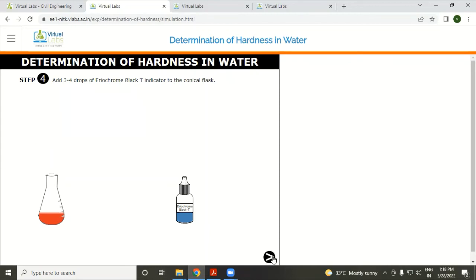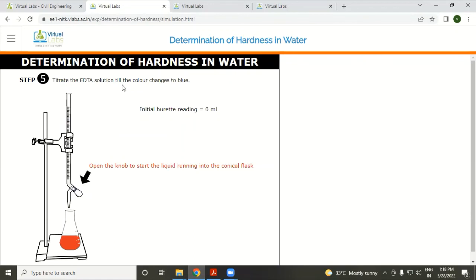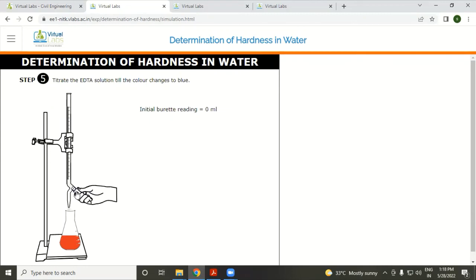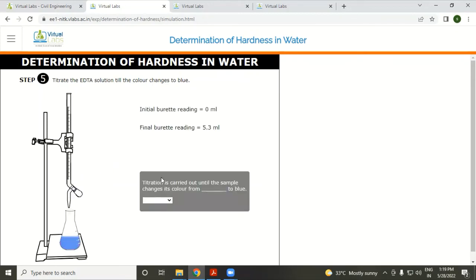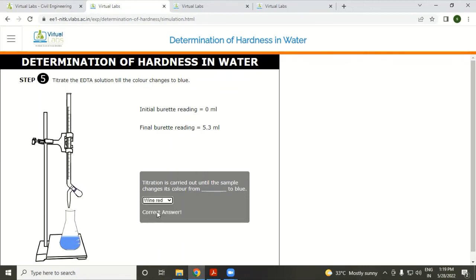Titrate the EDTA solution until the color changes to blue. Titrate the solution with the help of the burette knob. The titration is carried out until the sample changes color from wine/pink to blue.